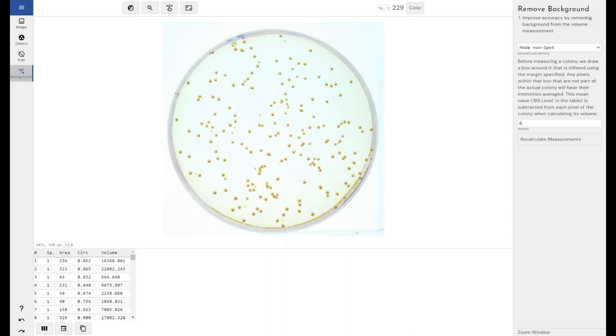Sorry, it doesn't take the average, it takes the mode. So the most common pixel value within that border is then applied to each colony. So this is a much more colony to colony or per colony background subtraction method.